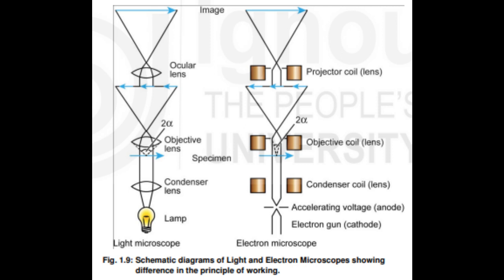In this type of microscope, a beam of highly focused electrons is directed towards a thin section of the specimen, less than 200 nanometers. The highly energetic incident electrons interact with the atoms in the sample and produce characteristic radiation and particles which form the image. A high-voltage electron beam is emitted by the electron gun, which is made up of a tungsten filament. The cathode is used as the electron source, while acceleration of the electron beam is produced by the anode.